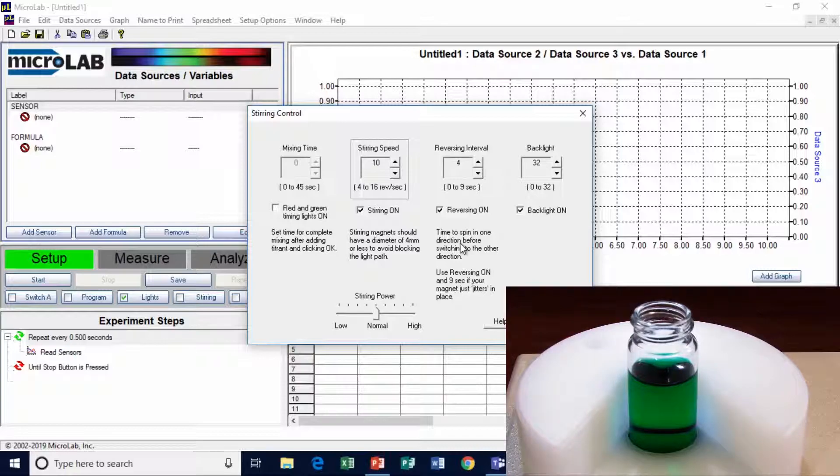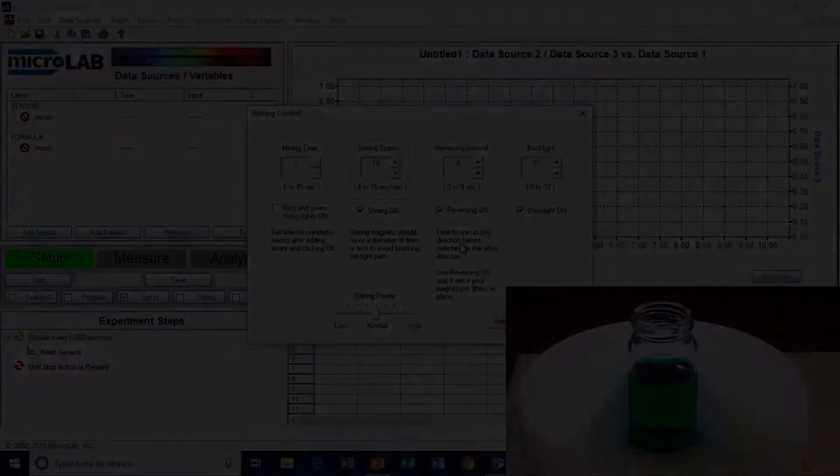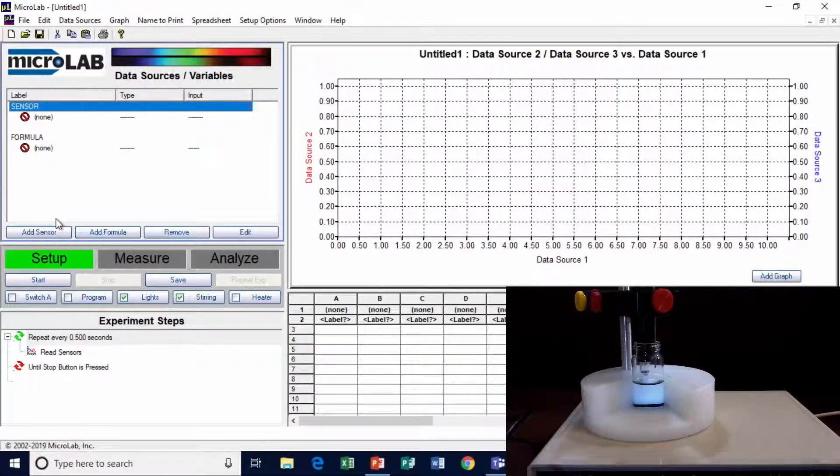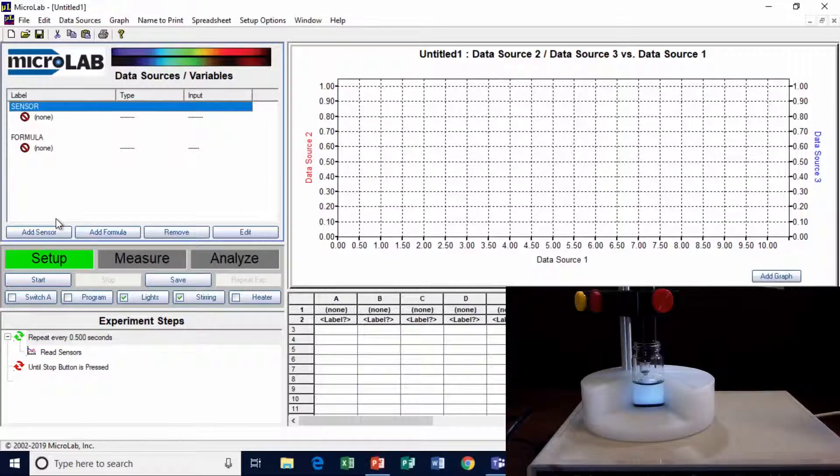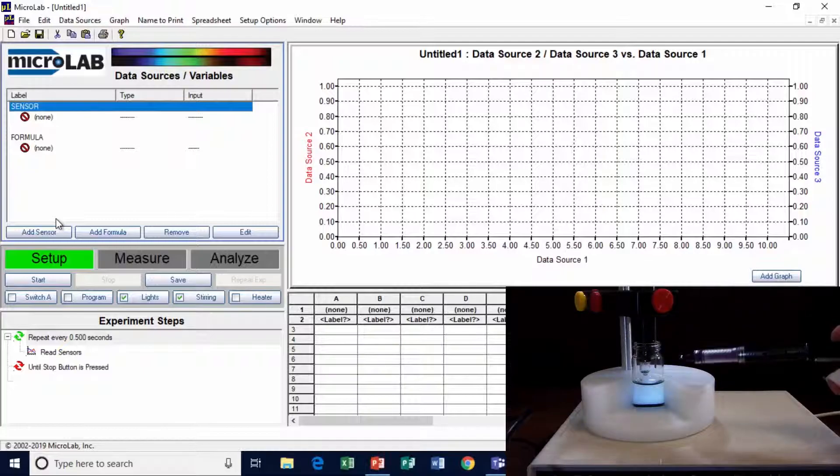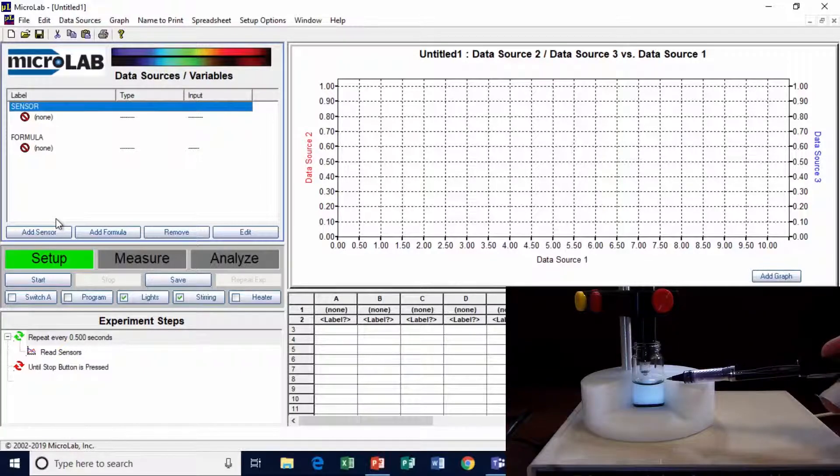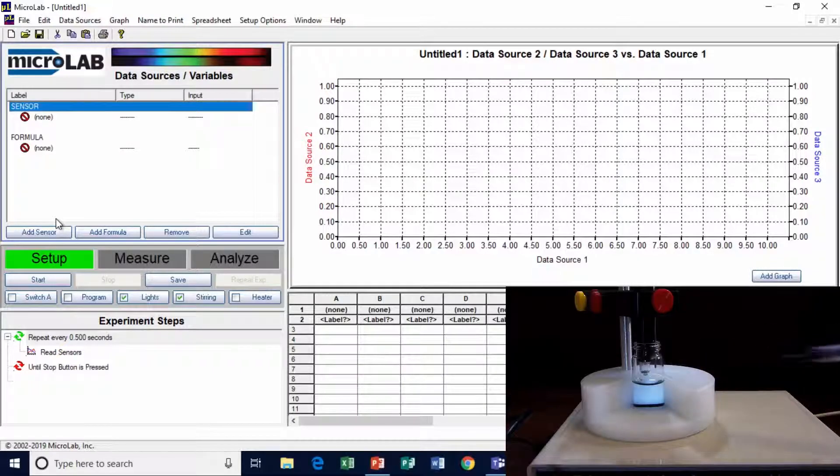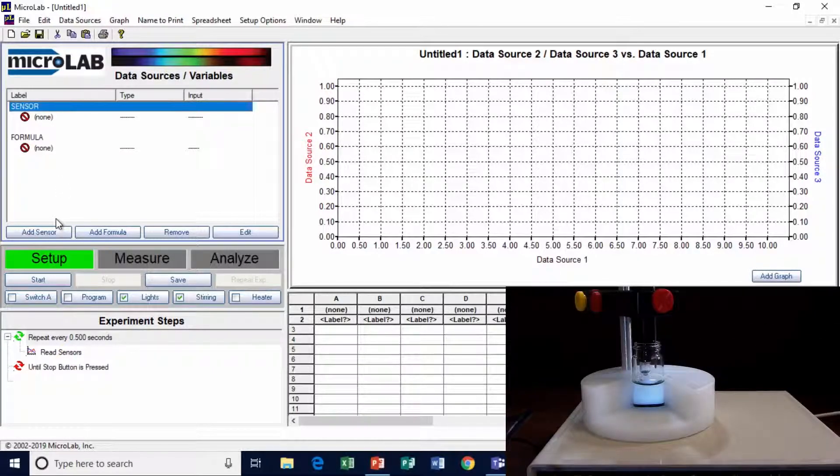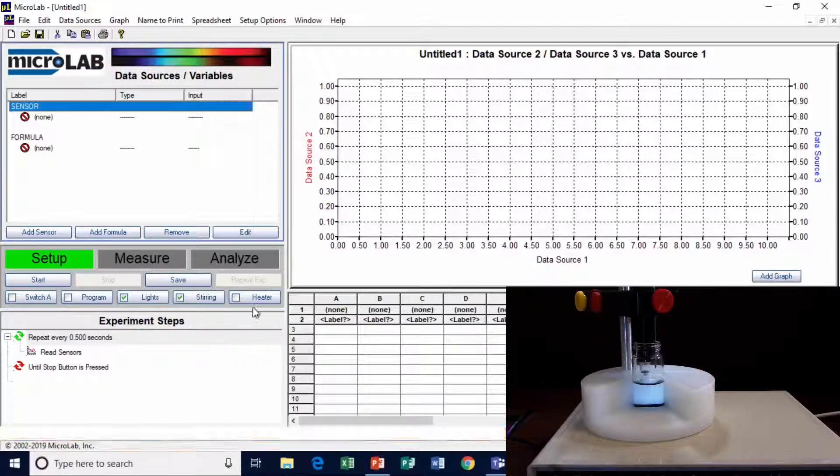Okay, now we'd like to shift to temperature. We have a fresh vial of water in this, and I've mounted the electrode holder above it here. There's a heater and a thermistor, which are pretty hard to see, but you can see a little better when I get it turned on. I'm going to turn the heater on right here just a little bit, so you can see it.